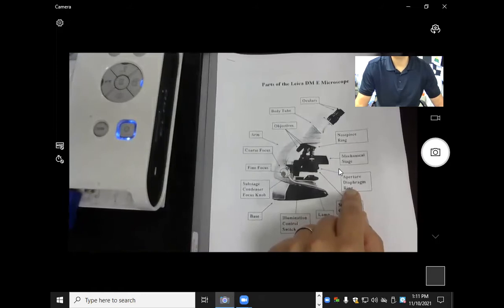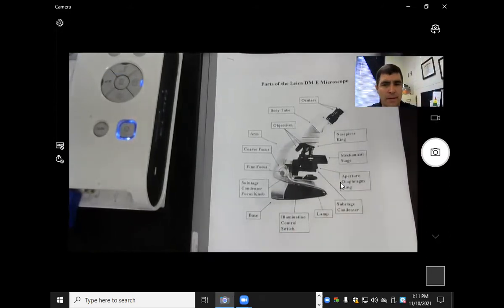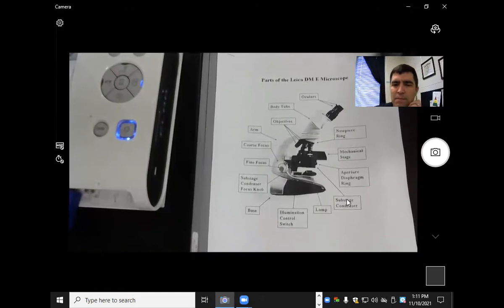This is the aperture diaphragm ring, which controls the hole right there. This is the lamp. This is the illumination control switch. This is the base. And I would change this one here — it says substage condenser knob, but I'd say that's more of the stage control knobs.